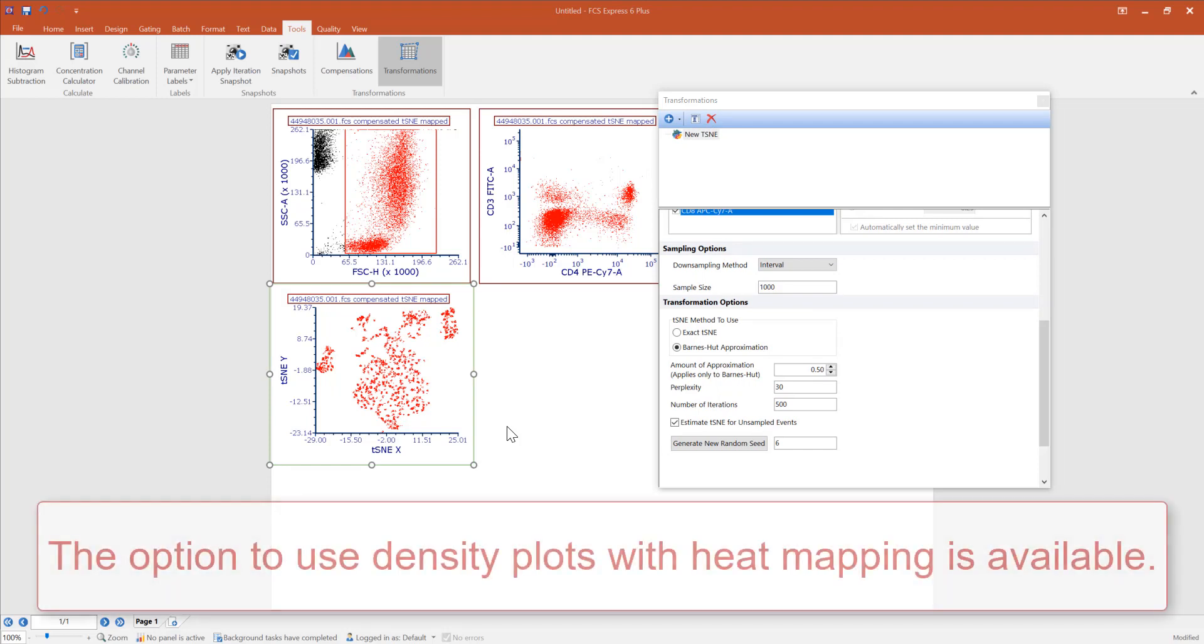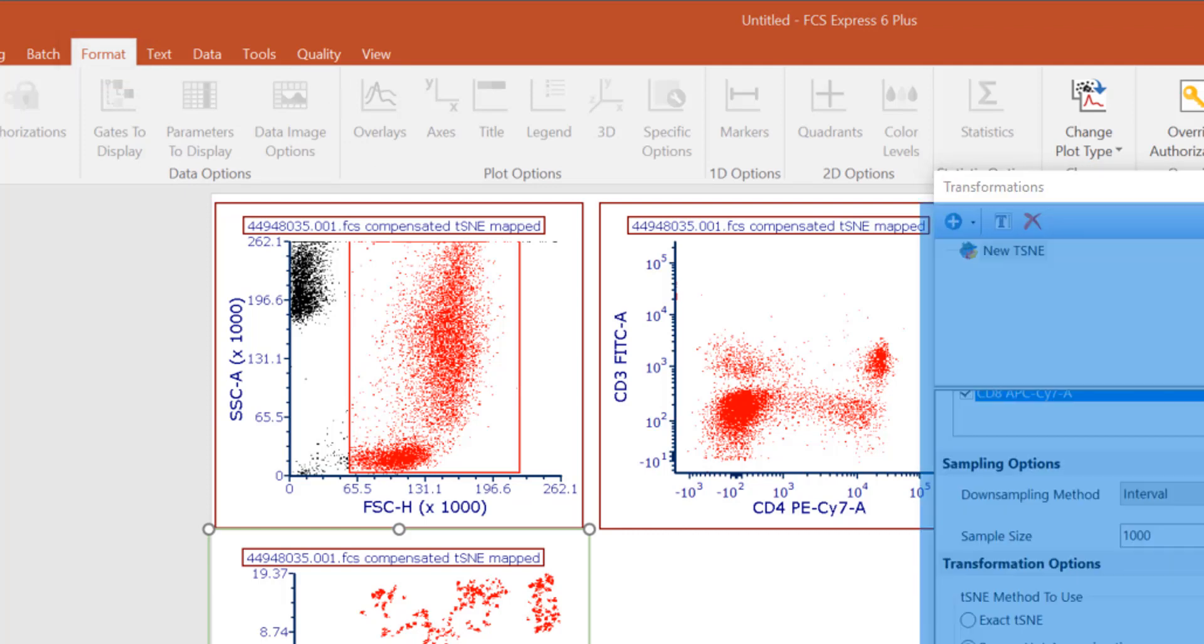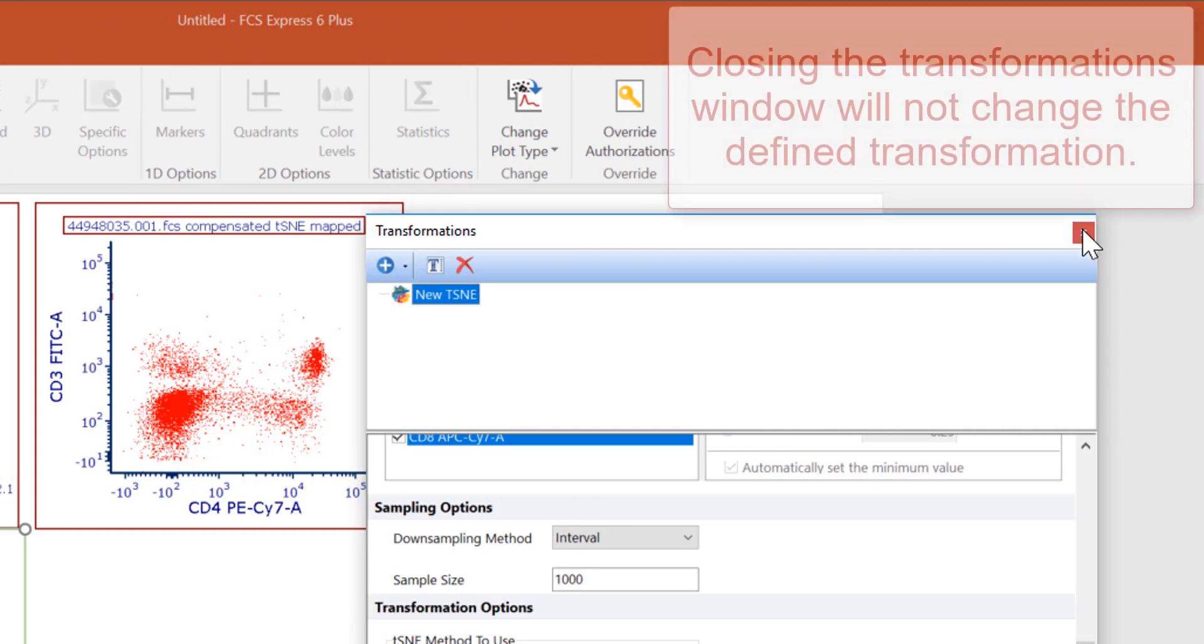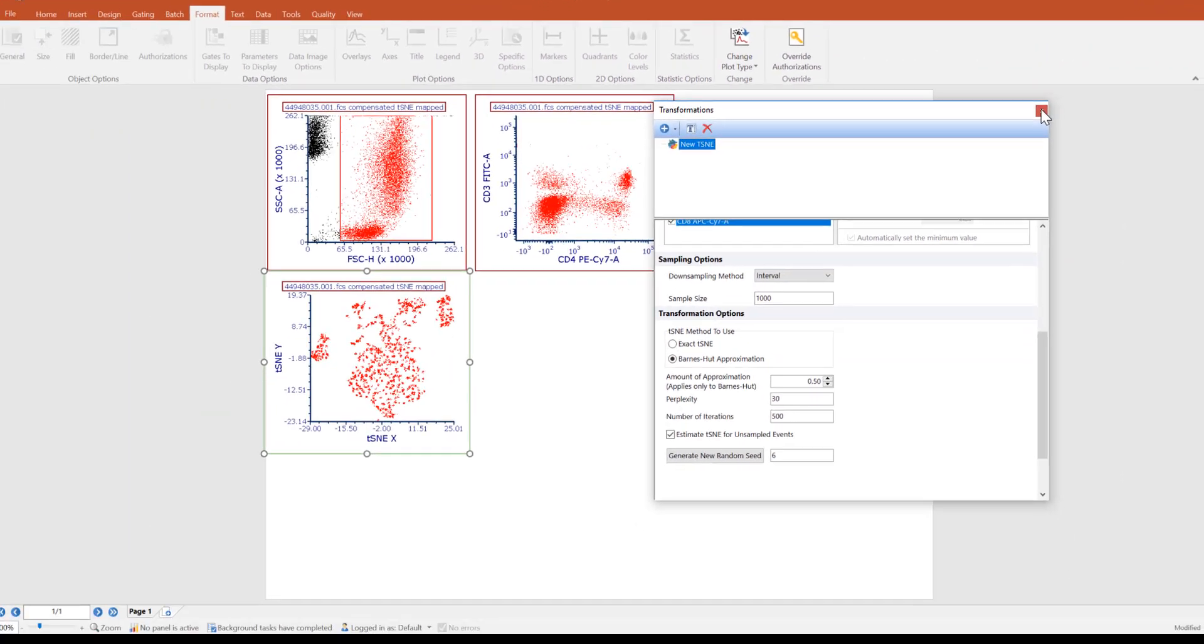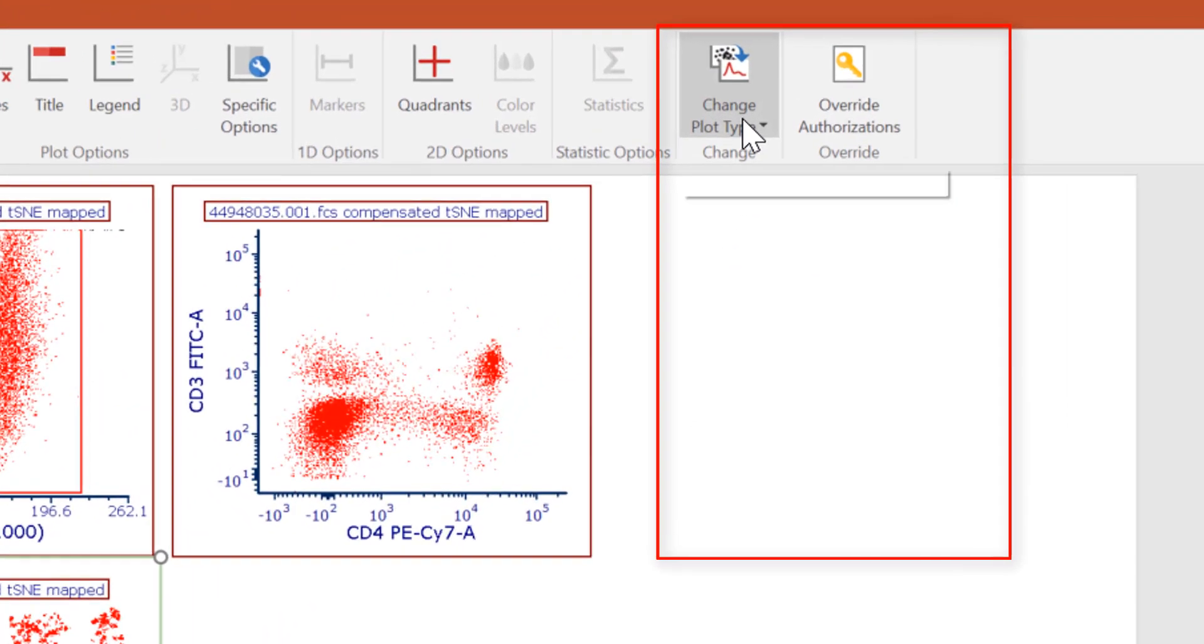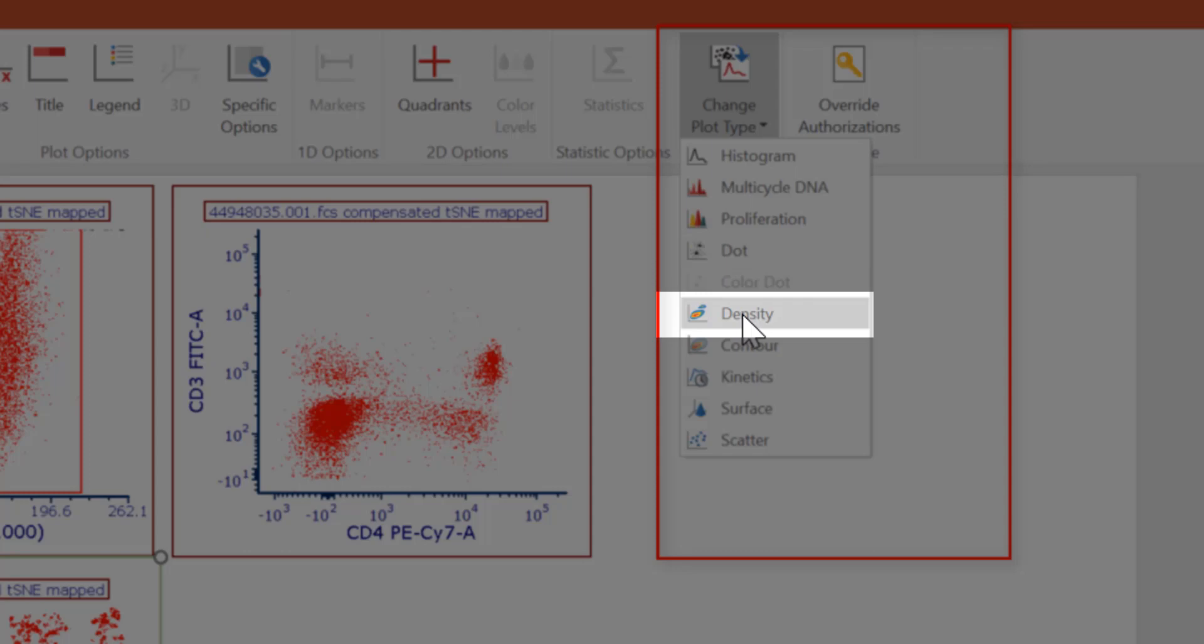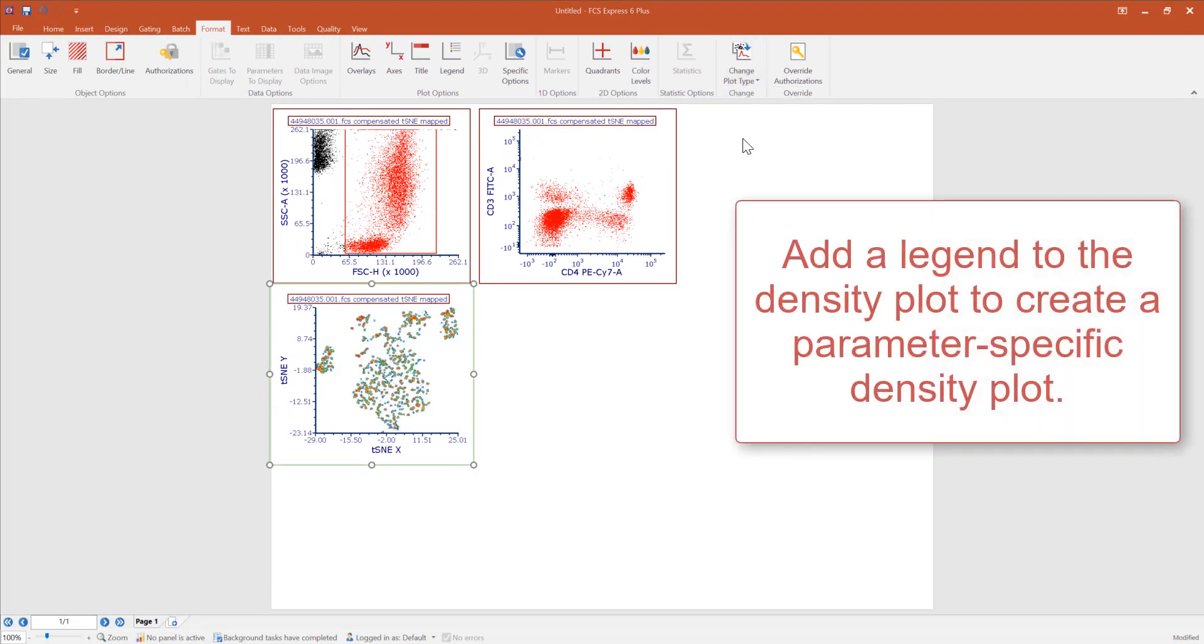The option to use density plots with heat mapping is available. To do so, select the current t-SNE plot in the layout and select the format tab in the ribbon. At this point, we can move our transformations window or close it. Closing the window will not affect the current transformation. We can reopen the window if we need to make additional changes. Select the change plot type and select the plot type to density plot.